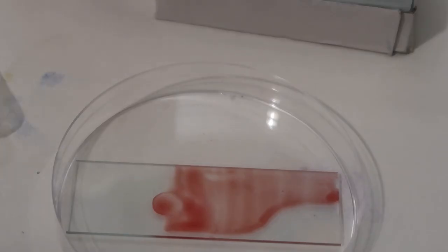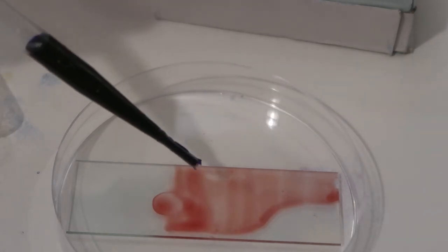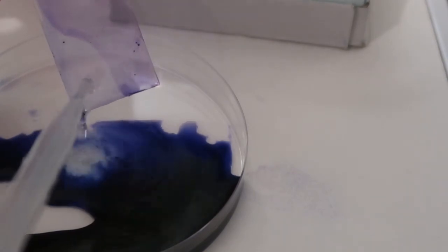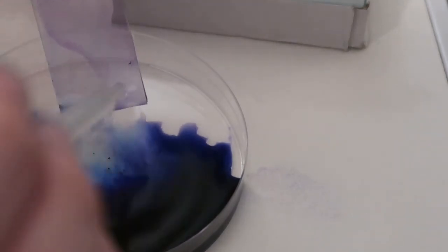After letting the blood dry for a minute, I applied the stain with a sterile pipette. I've used both cups and petri dishes for this portion and both work pretty well. After 10 more minutes, we wash off the excess stain and let it air dry. That's pretty much it, honestly. A pretty simple stain that takes about 20 minutes to complete.